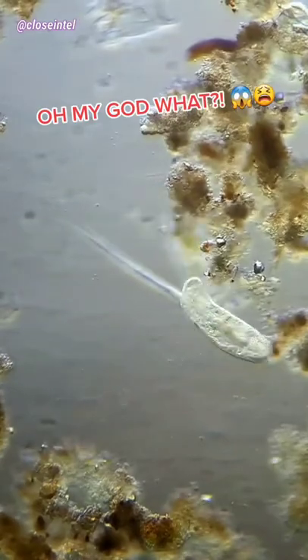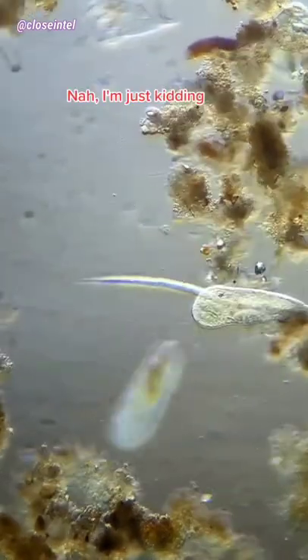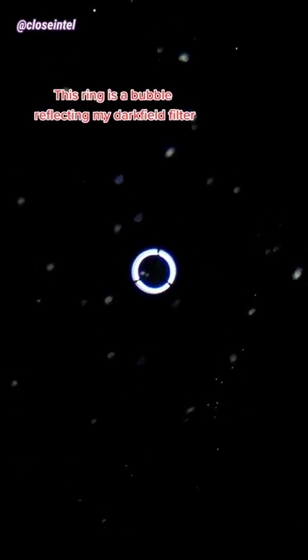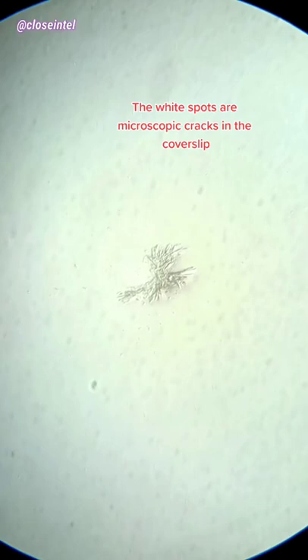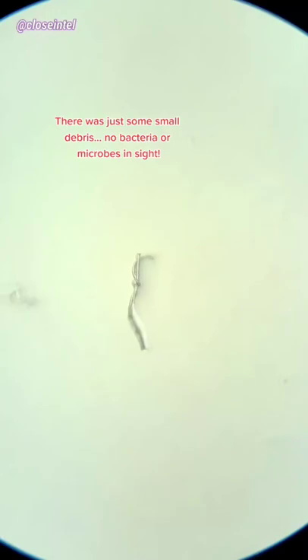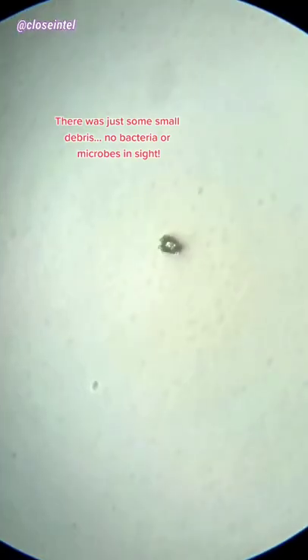Oh my god — nah, I'm just kidding. Here's the real results. This ring is a bubble reflecting my darkfield filter. The white spots are microscopic cracks in the cover slip. There was just some small debris — no bacteria or microbes in sight.